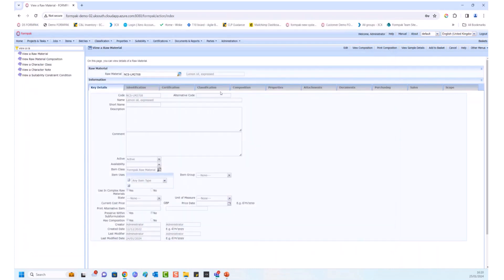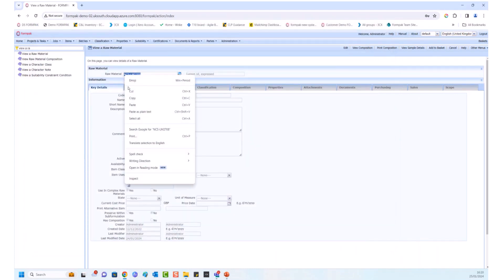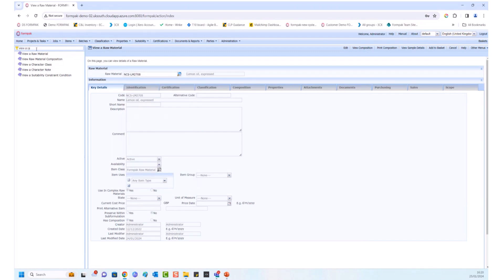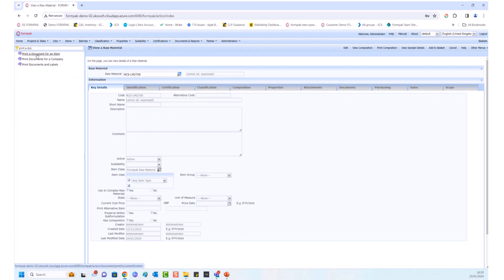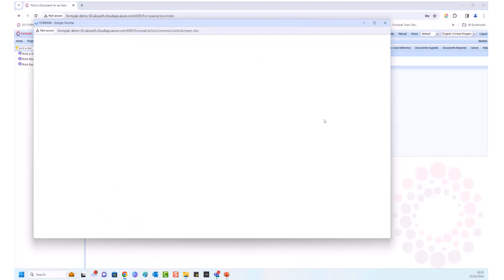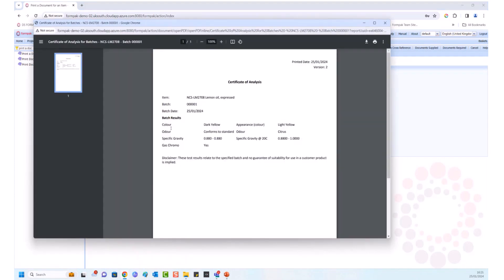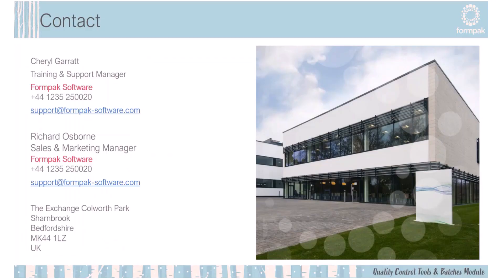You can also print a certificate of analysis including the batch test results. Go to Print a Document for an Item, select Certificate of Analysis — the batch ID is automatically generated — then click Print PDF. The certificate displays all the relevant batch information. That covers everything for this evening; thank you very much everybody.